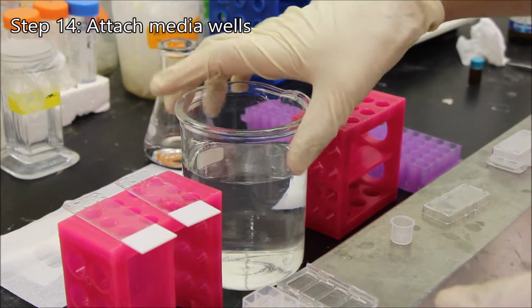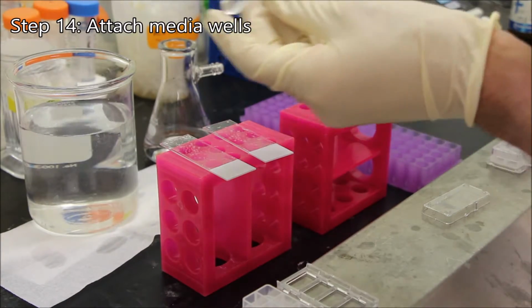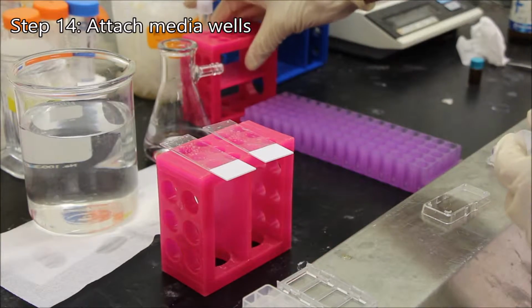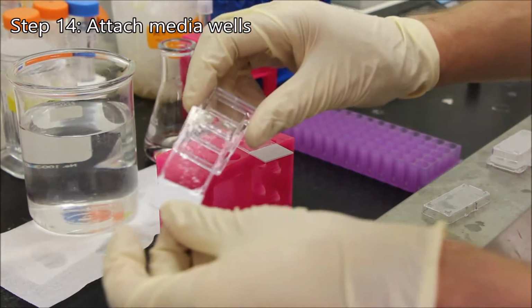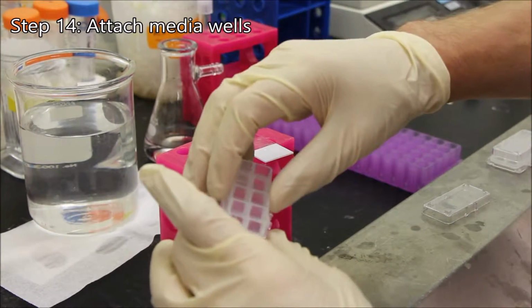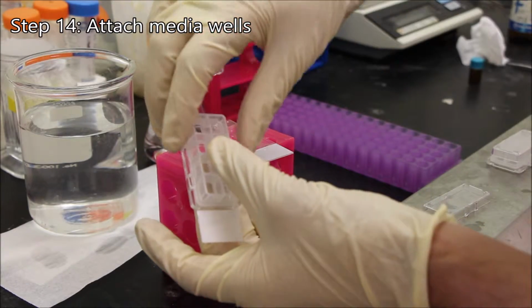So to clamp the media chamber onto this, and actually just as a side note, here's the original solution. You can see if I move it, the gel has definitely formed. So move this aside. So now, for each of these, you have the bottom holder, and you can just slide the microscope slide in there, and you take the media chamber and you place it on top, and it will just kind of fit into place. There's a ridge around the edge here which holds it.